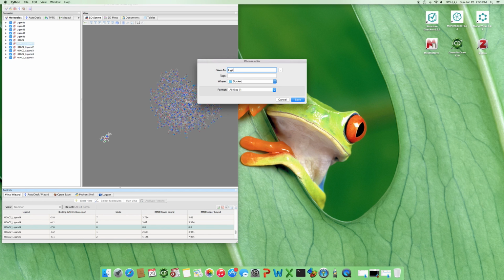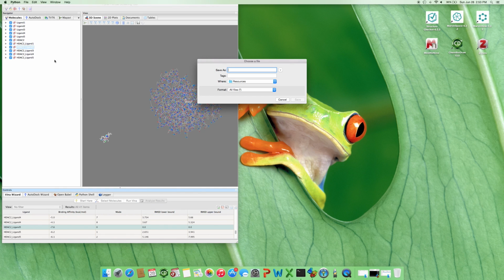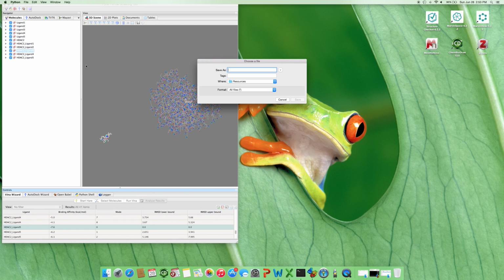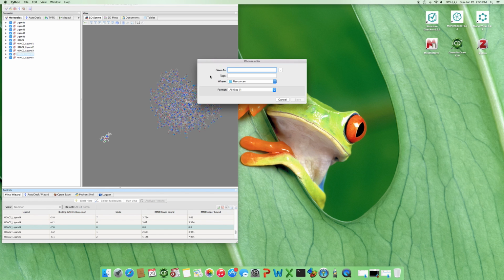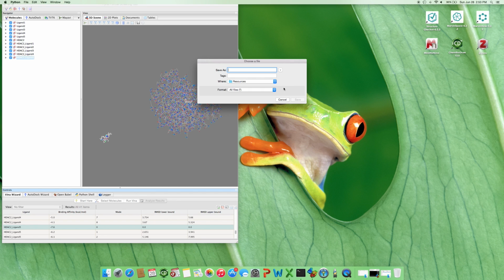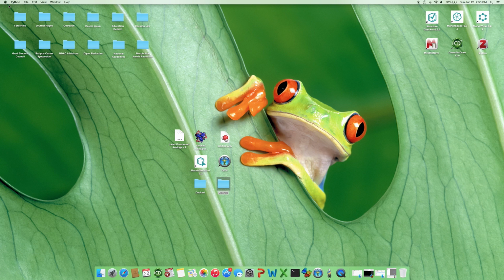Comparing the relative binding affinity of each of the compounds will give you an idea what PyRX thinks the most potent binder from your analog list is, and the ranking that PyRX would suggest. So in my abundant creativity, I am again naming them ligand 1, ligand 2, ligand 3, and so forth. You can name them whatever you want as long as you know what they are. Alright, they're now all saved in the docked folder.